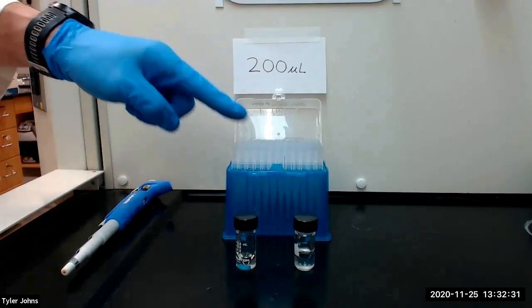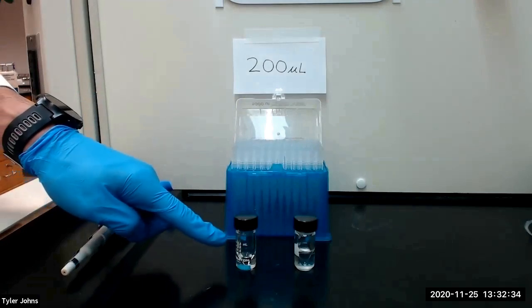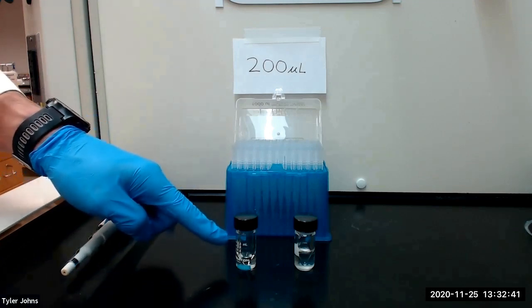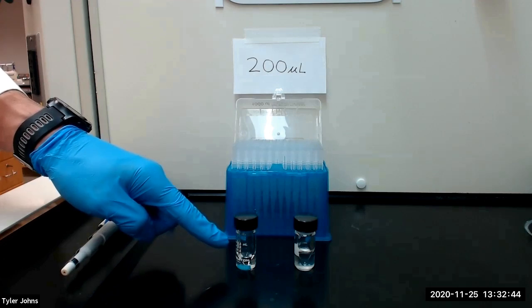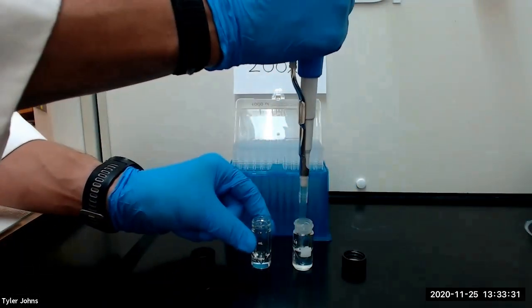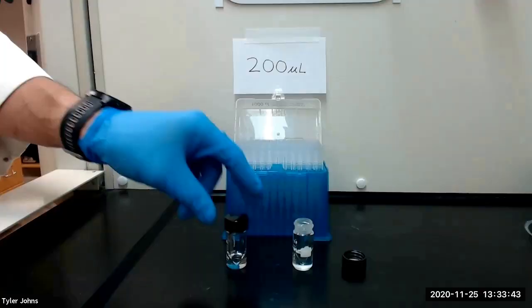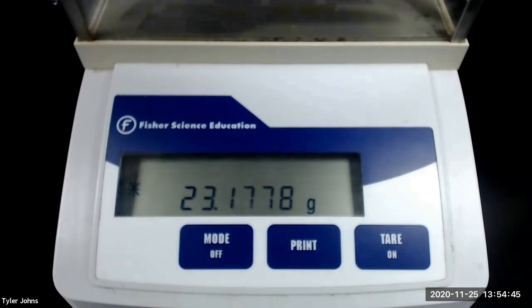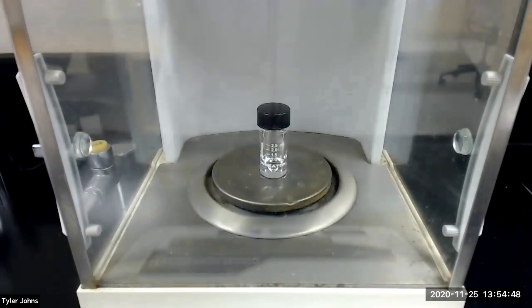We will next add 200 microliters of distillate to the new pre-weighed 3 milliliter conical vial using an automatic micropipette. We will then re-weigh the conical vial plus the 200 microliters of distillate — the mass is 23.1778 grams — and this will enable us to determine the density of our distillate. You can then use the provided table to determine the percentage composition by weight of ethanol in the distillate from the density of the sample.